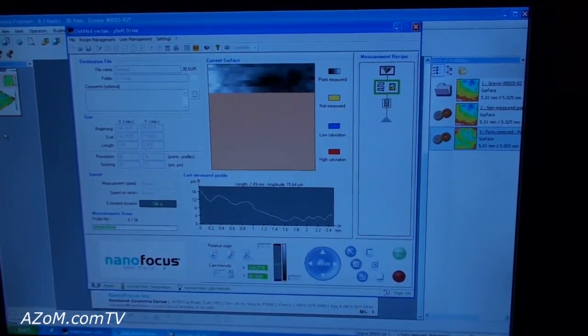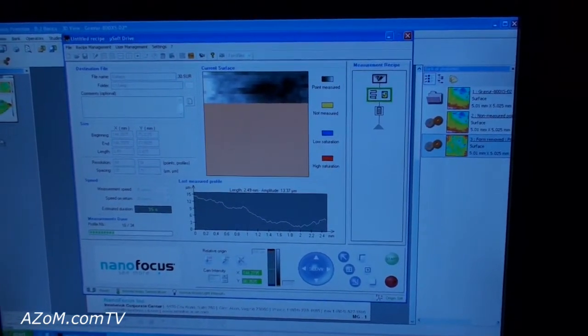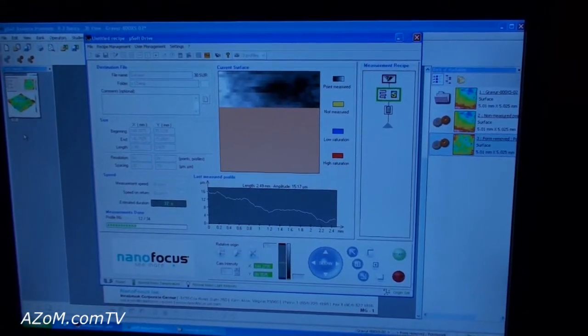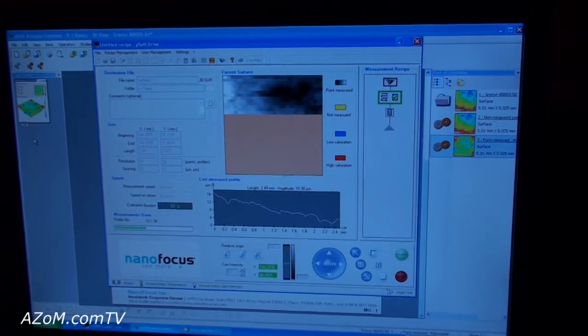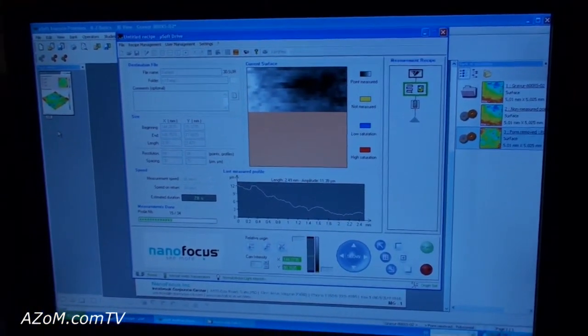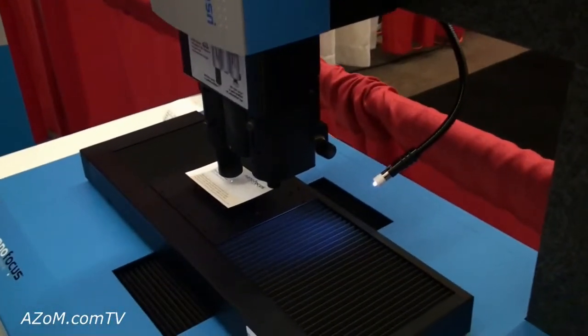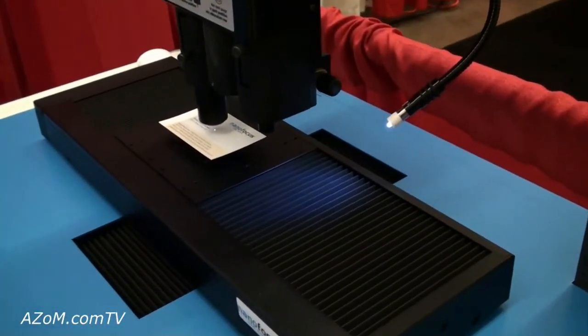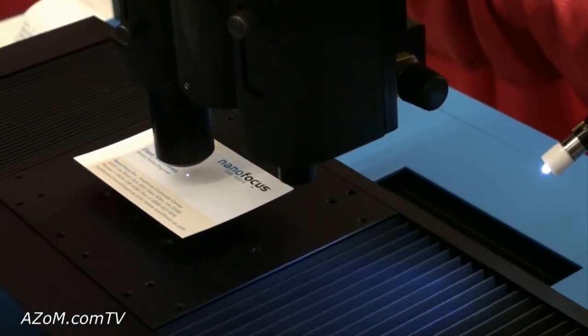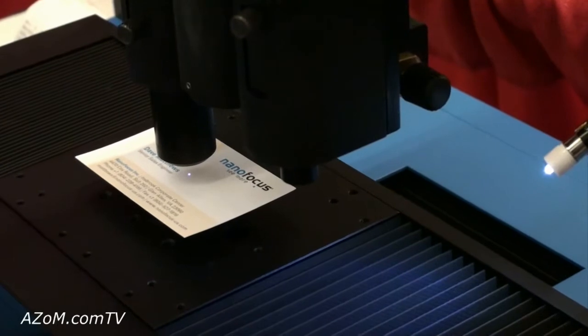One of the main applications for this is what we're doing now — measuring paper. Different grades of paper will have different surface roughnesses, and this will determine the price point of that paper or whether the paper is being produced according to the company's specifications. So we have quality control and production control applications in the paper industry.